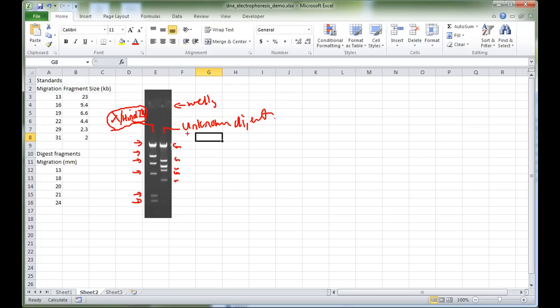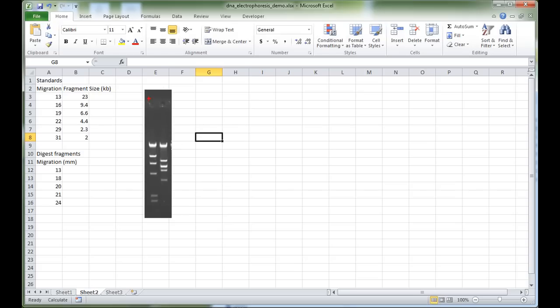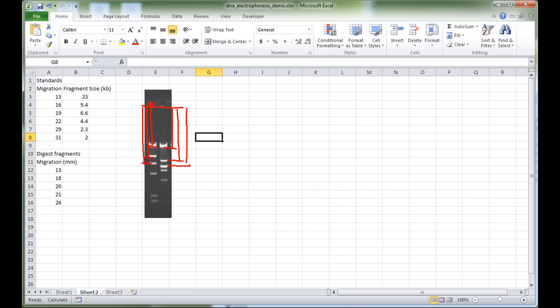Using that information we can calculate the kilobase size of the unknown bands. The way to measure is by starting from the wells — you would have drawn a line at the end of your wells and measured from that line to a consistent area of each band. That distance, that distance, that distance, and so on — and also the distances of the unknown fragment migrations.